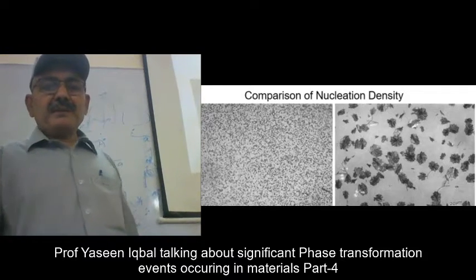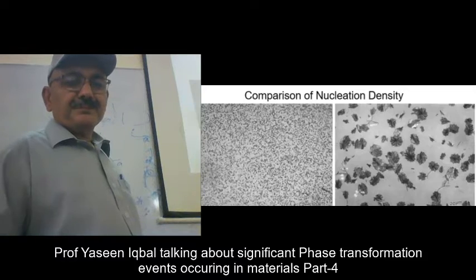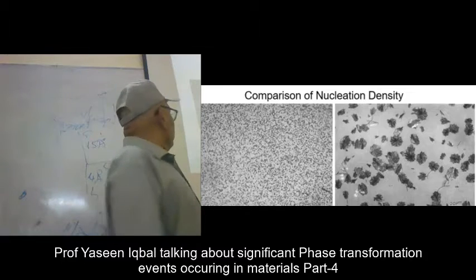Now, when you go further, look back, look here. This is an optical microscope image, right? This is 20 micrometer, so the crystal size is about 20 micrometer.